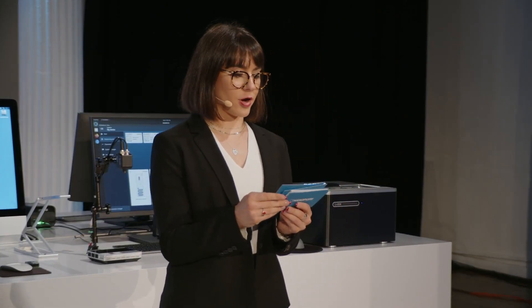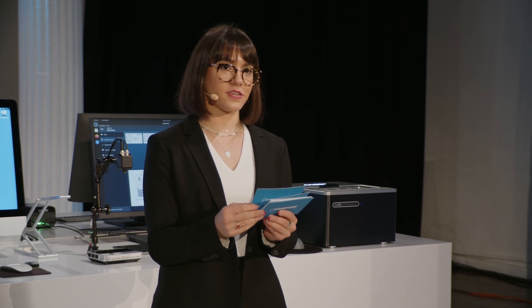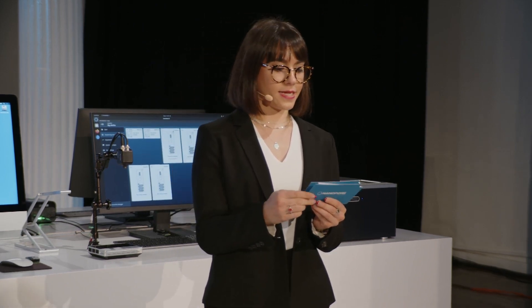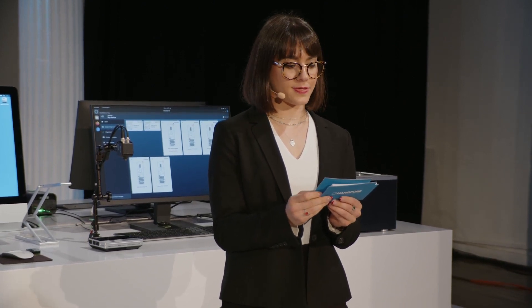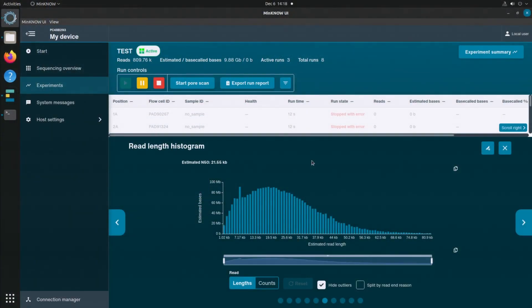After your successful library prep with kit V14 chemistry, you're ready to take advantage of the power of the PromethION flow cell. With the kit 14 chemistry, SFE expansion kit, and the PromethION flow cell, you're able to get 30x coverage of one human genome, or 20x coverage if you want to run two human genomes on a single flow cell.